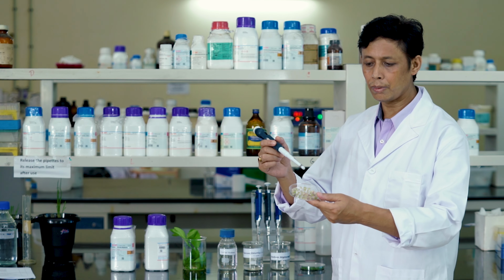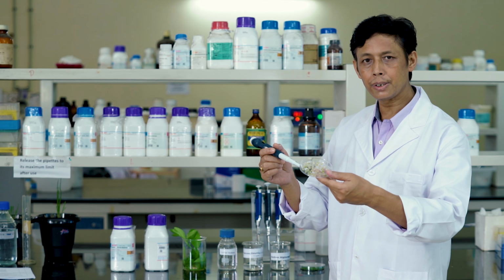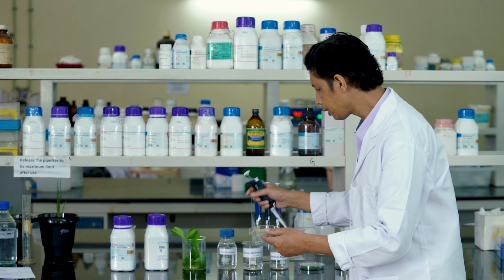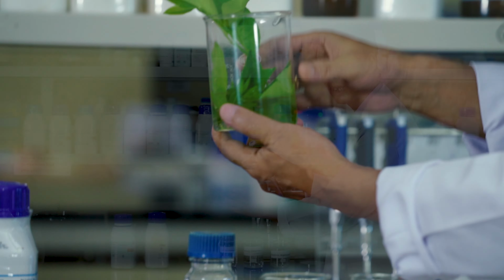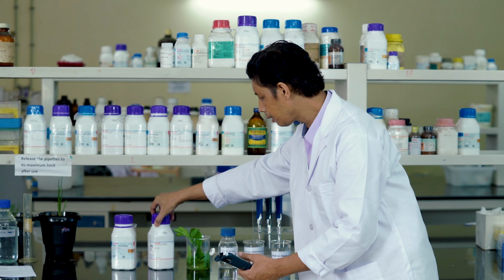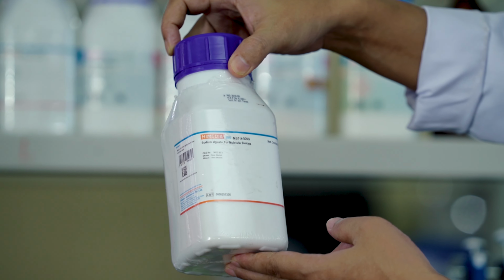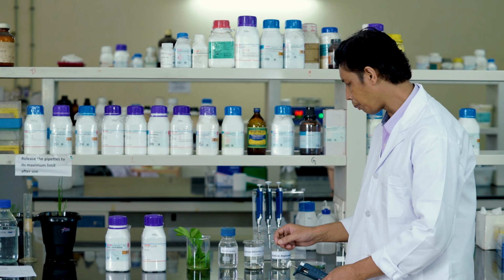As you can see, these are some of the artificial seeds which we have prepared in the laboratory. To produce artificial seeds, we need certain materials. As you can see here, these are some of the materials. First of all, we need the explant plant. Today we will be using citrus as the explant plant. Then we have two important chemicals: calcium chloride and sodium alginate. These are the two most important chemicals to carry out the production of artificial seeds in laboratory conditions.